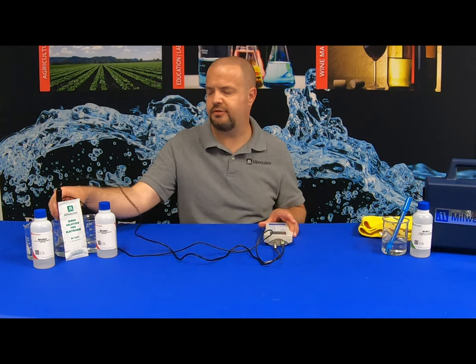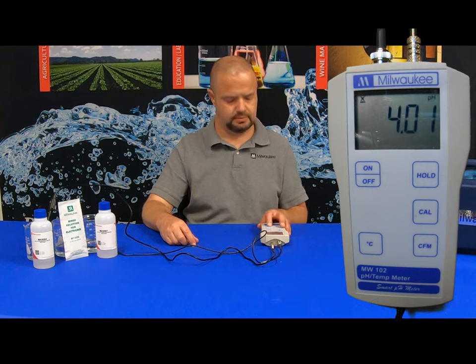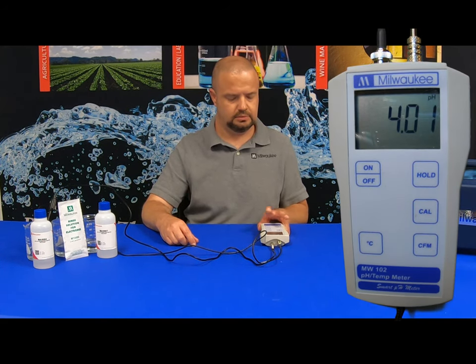It is now asking for the 4 buffer, so we're going to give it a quick rinse in the rinse solution and then stick the probes in the 4.01 buffer solution. Again, the pH icon starts to flash. We want to wait for the icon to stop flashing prior to hitting CFM. Once it has stopped flashing, hit CFM to confirm calibration. The MW102 is now fully calibrated and ready for use.